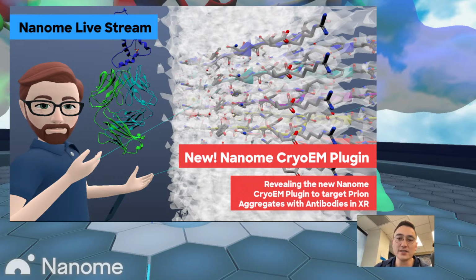Today, we're excited to introduce you to the latest addition to the Nanome platform, the new cryo-EM plugin. This powerful plugin allows Nanome users to analyze cryo-EM maps with ease and efficiency, thanks to its innovative features, with the ability to load maps from EMDB and align them to their corresponding RCSB model. Users can now visualize and analyze the structural details of complex macromolecules in unprecedented detail.